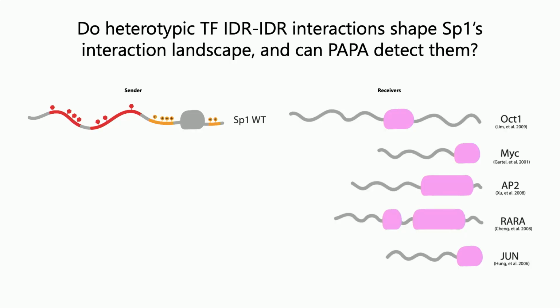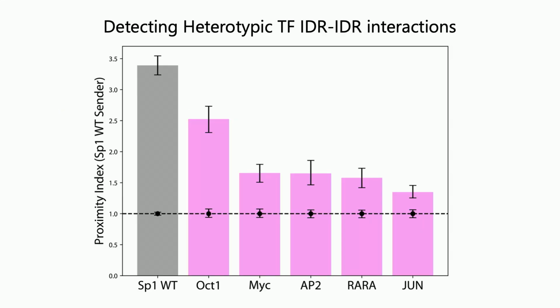Then Abrar studied the interaction of SP1 with other transcription factors. And I'm adding this slide to remind you that the system is far more complex than SP1 interactions. You have a myriad of different transcription factors. OCT1, for example, and SP1 have a tendency to interact together, and they are going to favor an interaction with chromatin when they interact together. And some of the factors have either weak or transient interactions with SP1. And so we have a different zoology of interactions.